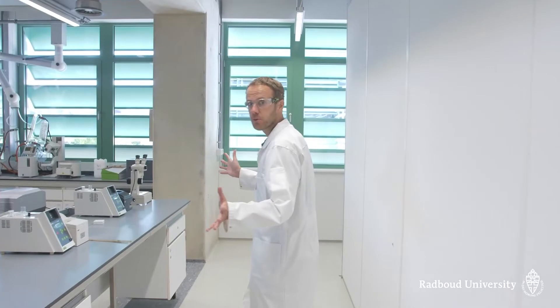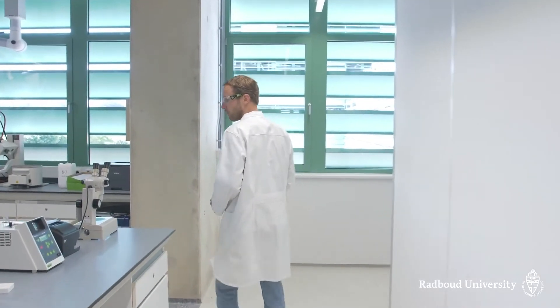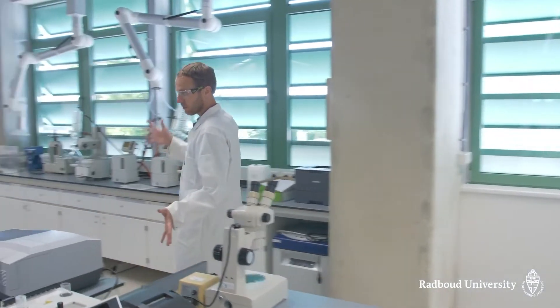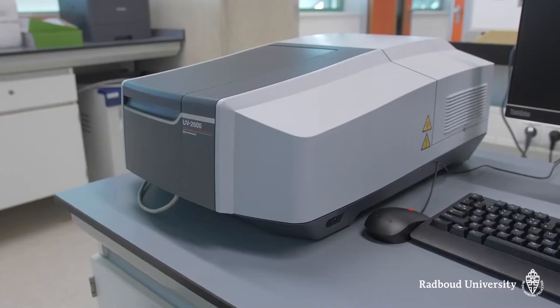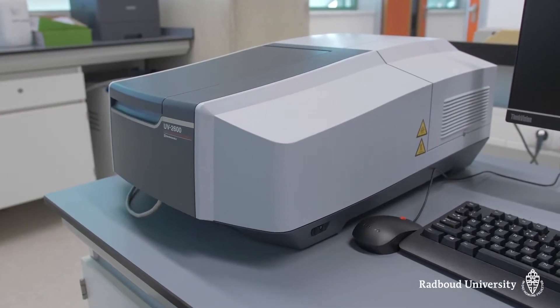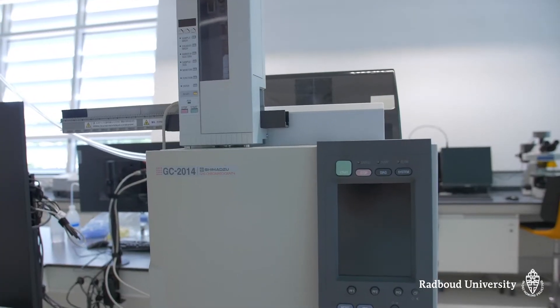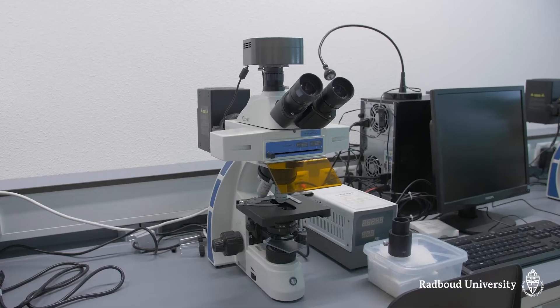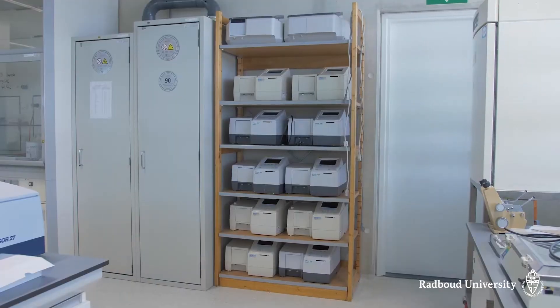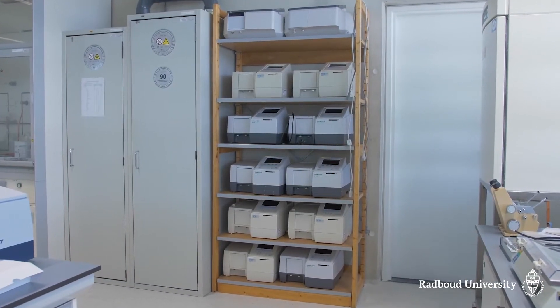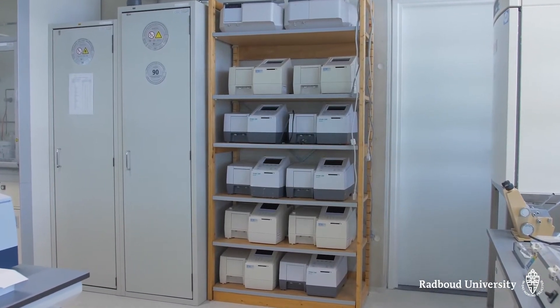As you can see here, this is the measurement room where our students do their more advanced measurements on the UV spectrometer for instance, the rotary evaporators, gas chromatographs, fluorescence microscopes. If you compare our equipment to a research department where they have one or two UV spectrometers, we typically have 40, which enables all students to get hands-on experience with the equipment.